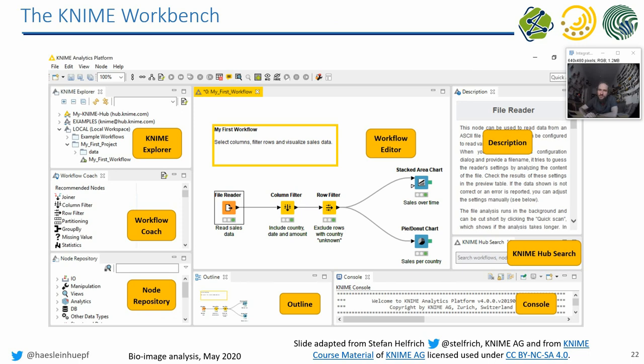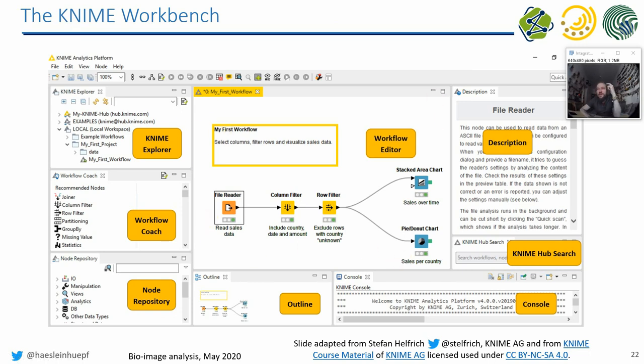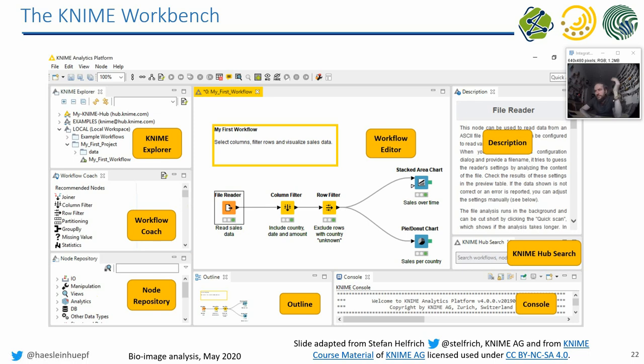This is how the KNIME software basically looks like. At the beginning, it's like, wow, so many windows. But it's actually quite easy. So you have in the middle, you have your so-called workflow editor. You start with a white area, and then you can, from the node repository here on the bottom left, you can drop nodes into your workflow. What's also very helpful, especially for beginners, is the KNIME Explorer, which allows you to go through pre-existing workflows, which either come with the software to your hard drive, or which exist somewhere in the internet.